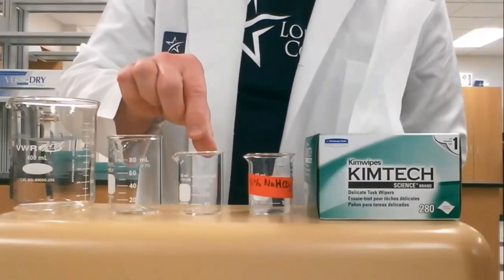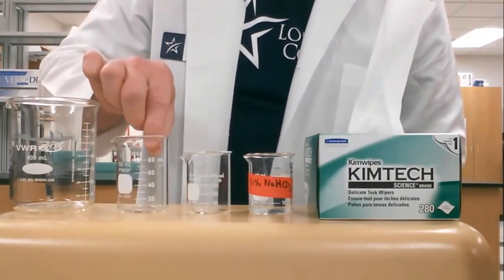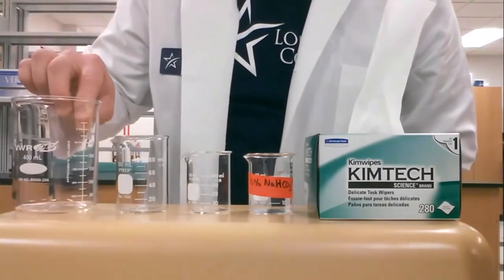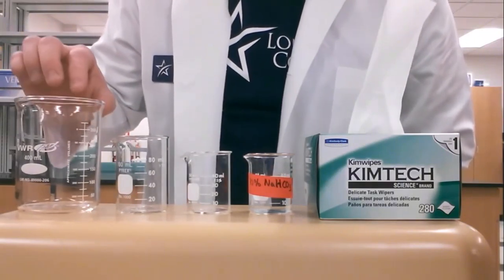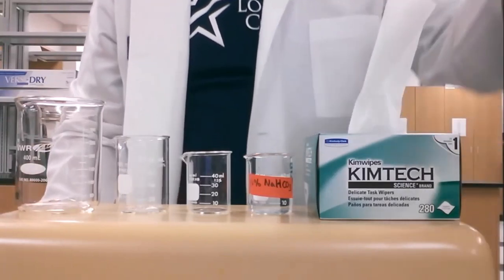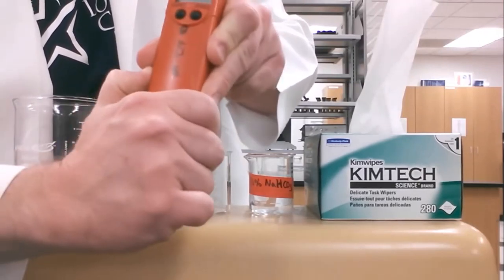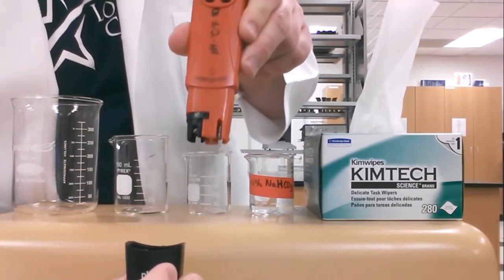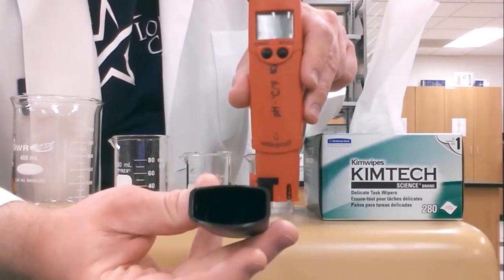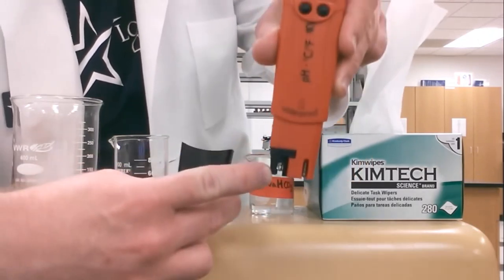And then you can use either a small 50 ml beaker or a 100 ml beaker. And I also have a larger beaker. You don't have to use this, but I'm going to use this for a rinsing step because I don't have a sink right here. So the first thing we're going to do is remove the cap from the pH meter. This may take a little bit of strength, so pop this cap off. Be careful because there is a little bit of solution in this cap, and that's what protects our pH electrode, this little glass bulb here, when we're not using it.